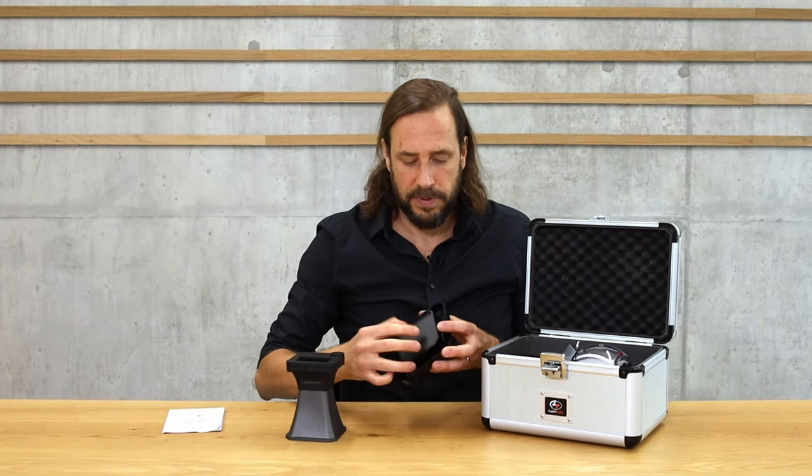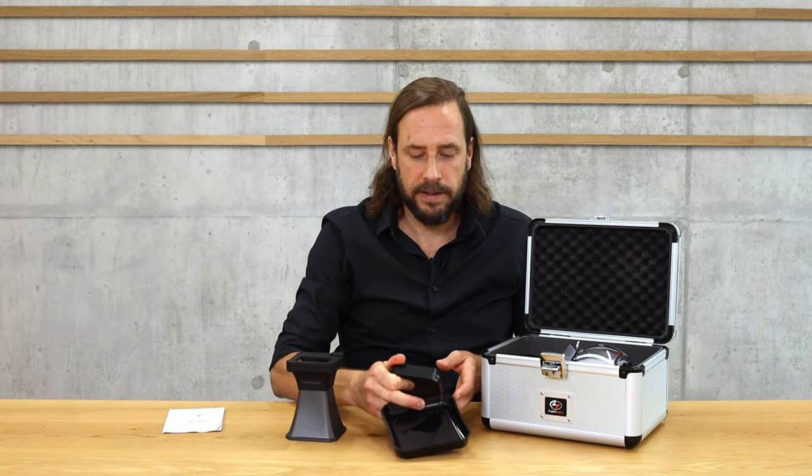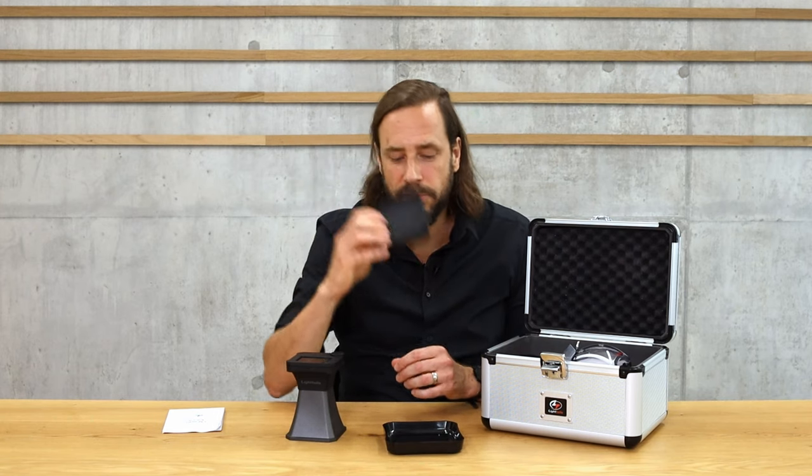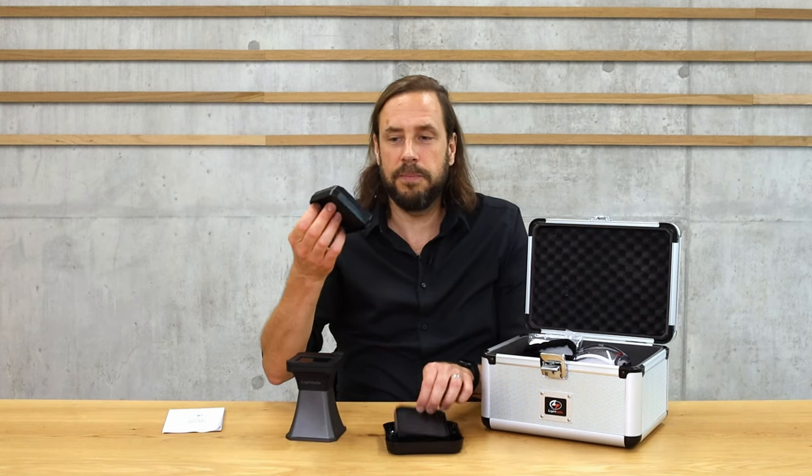Here is the CM200 itself. It has these little cups for coffee color samples — one side is a bit deeper for whole beans, and a bit flatter for ground coffee. When you get the machine there will be two cups so you can prepare two samples at once.